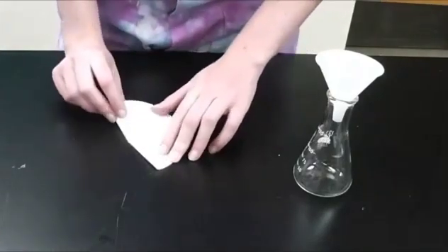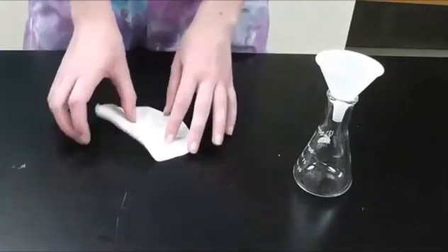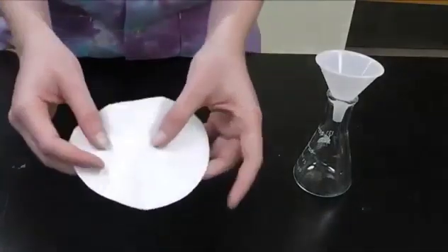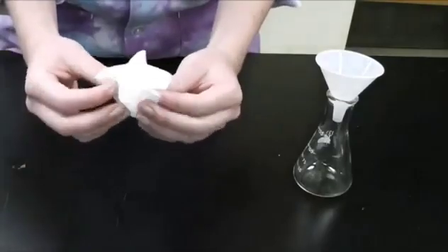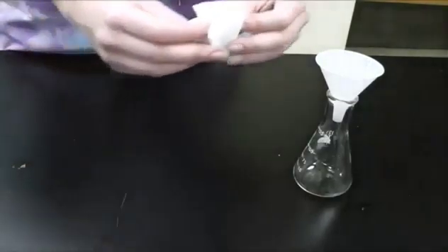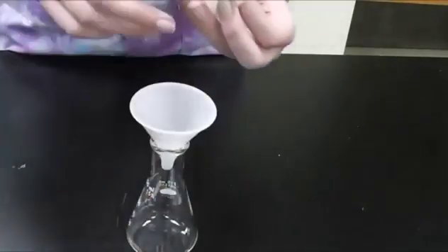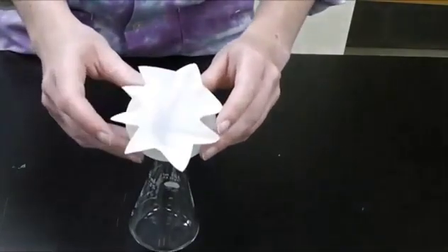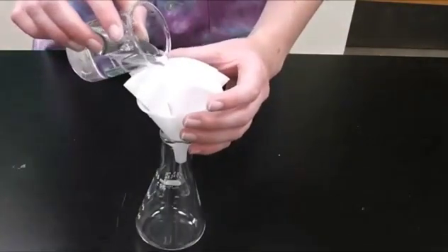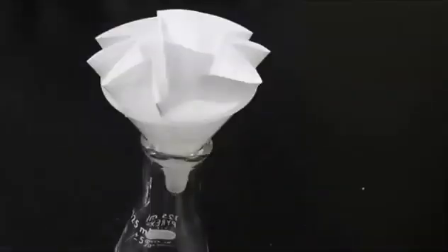When you are done, your filter paper should be divided into 16ths with alternating creases up and down, as seen here. To put your filter paper in the funnel, simply fold it in gently and gently place it in the funnel. Then, you can filter solids out of your liquid by gently pouring your liquid into the filter paper.